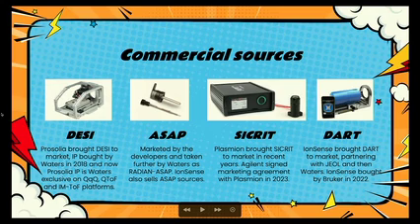And then finally there's DART, direct analysis in real time. Again, it's a plasma source, but this has a bit more heat and a bit more electronic potential to it. And IonSense brought it to market. Sort of started off with JEOL. IonSense then sort of spun out. They did a partnership with Waters.